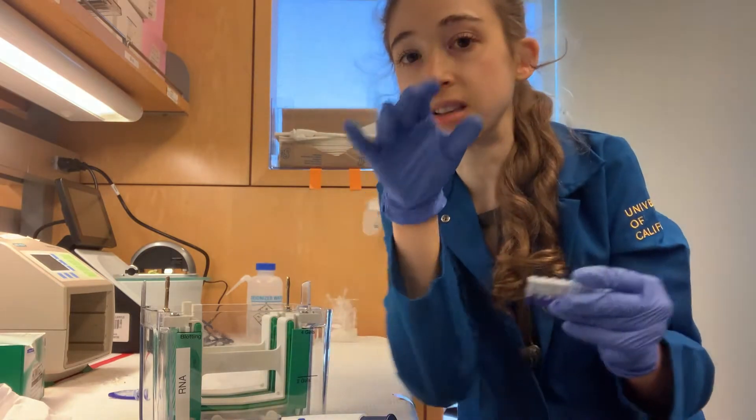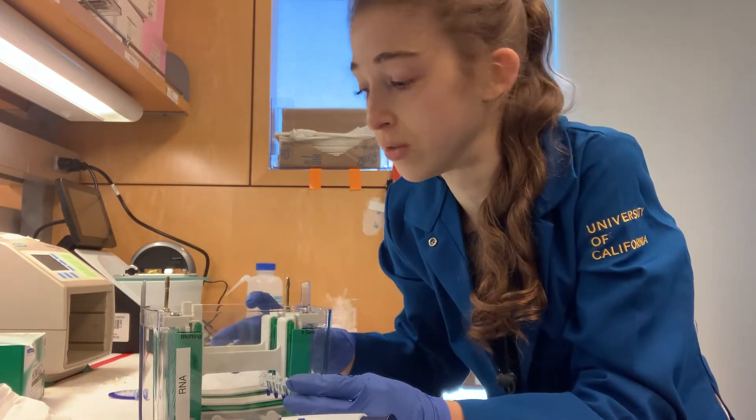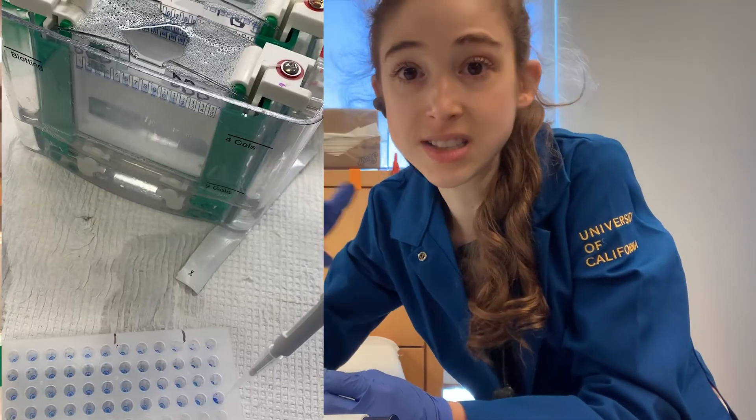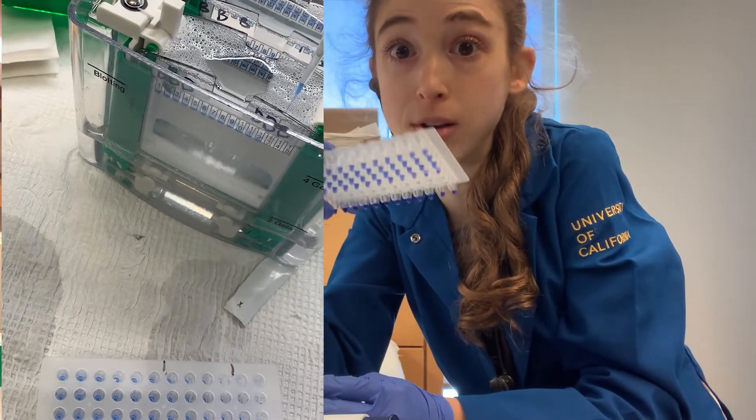Unfortunately, it doesn't do the actual loading for you — you can't use the multi-channel to load the gel. So I'm still going to have to load four gels worth of samples, but at least I saved some time on preparing them.